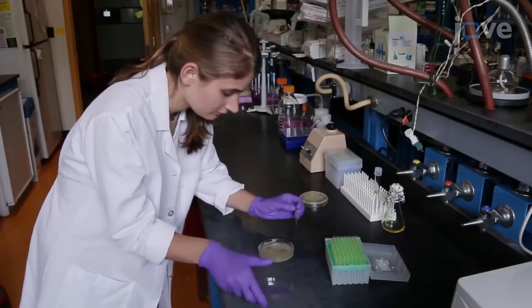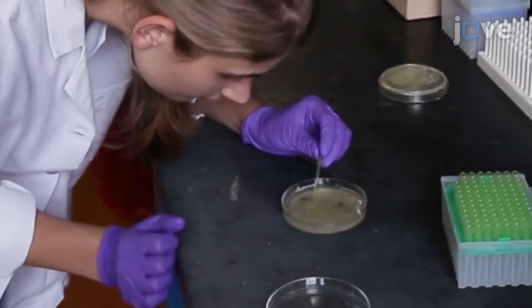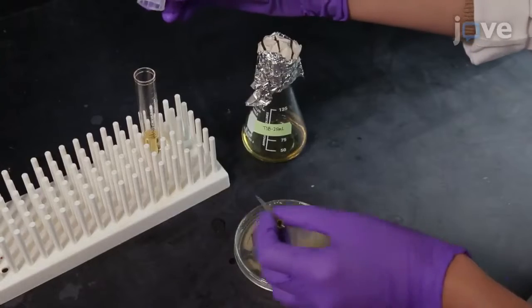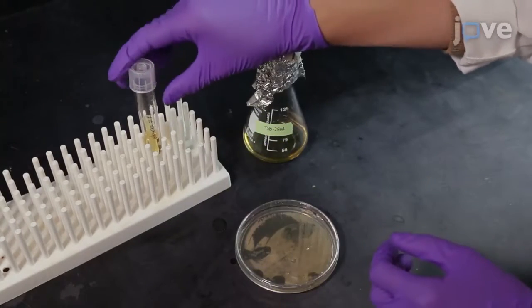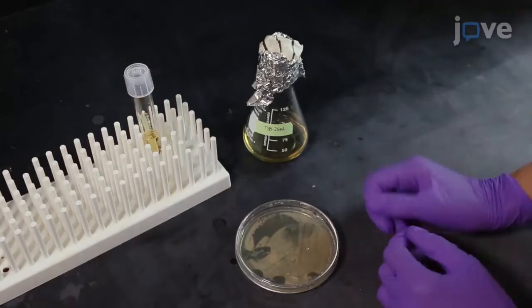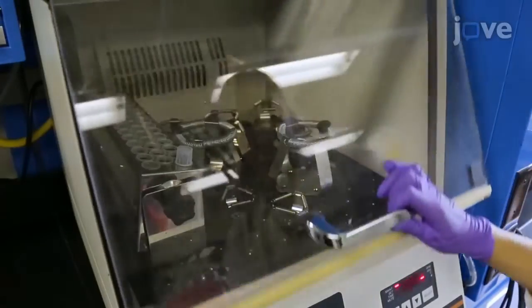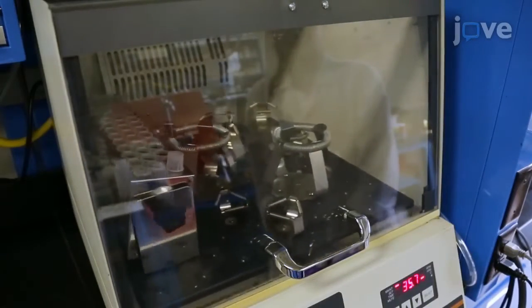To set up an overnight culture, use a sterile micropipette tip to transfer a single bacterial colony from a solid agar culture plate to a 14 milliliter culture tube containing 2 to 3 milliliters of 3% trypticase soy broth, TSB, for a 16 to 21 hour incubation at 37 degrees Celsius with shaking.